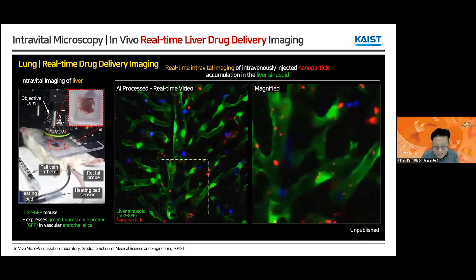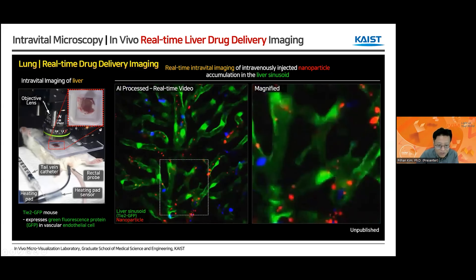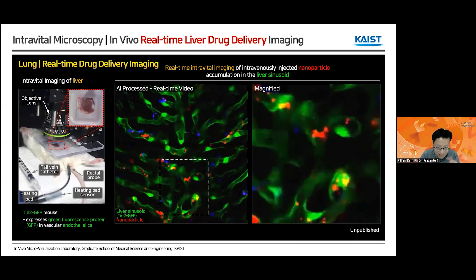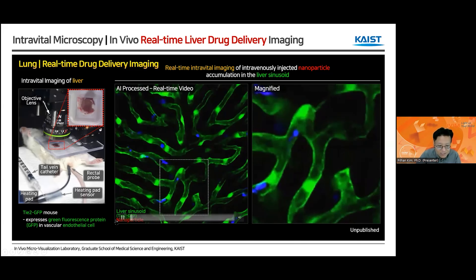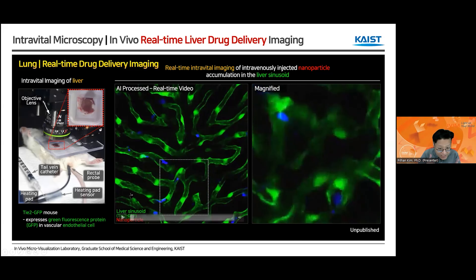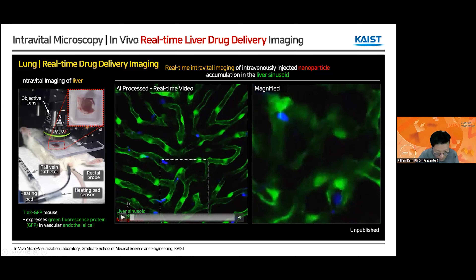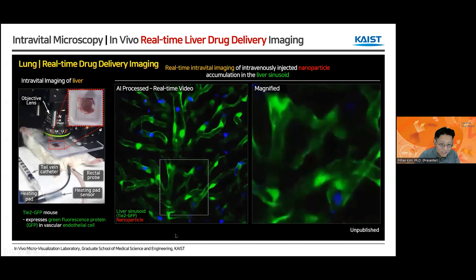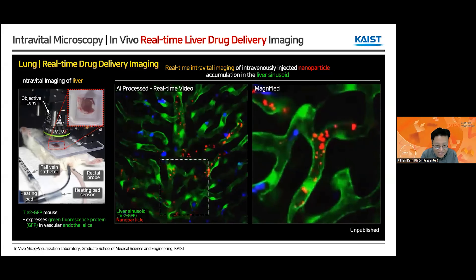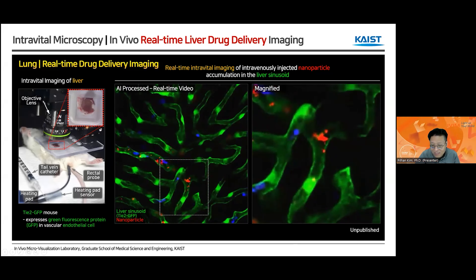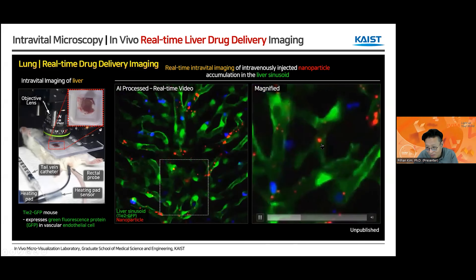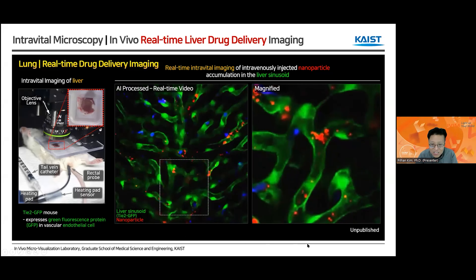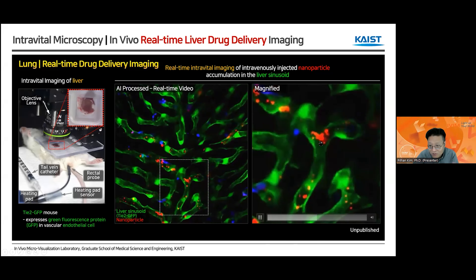When we look at the liver, the liver sinusoid endothelial cells strongly express GFP in green. When we start the recording, we begin intravenous injection of a red-color nanoparticle through the tail vein. After roughly 10 seconds, we can see the flowing nanoparticle inside the liver sinusoid, and we can quickly see how this nanoparticle starts to accumulate inside the liver sinusoid in real time. This is just a 30-second video showing the very first moment of delivery of this nanoparticle to the liver.